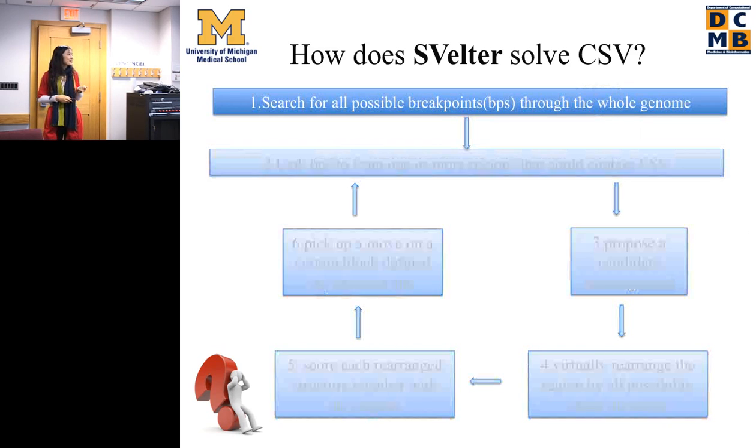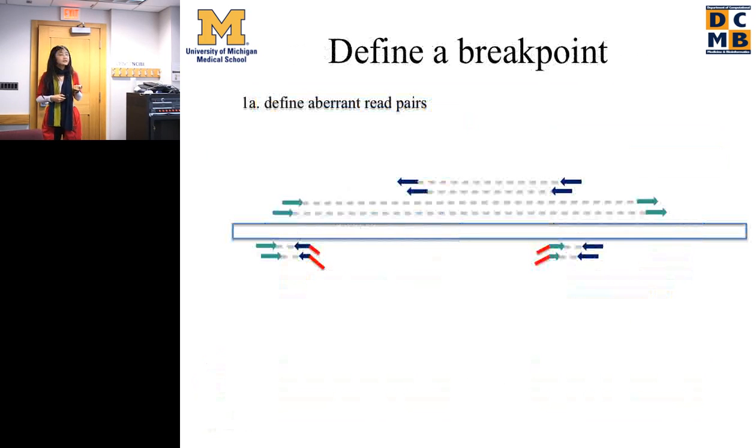So first, let's talk about how we define the breakpoints. We define the breakpoints based on the signals from aberrant read pairs. Let's first define the aberrant reads.